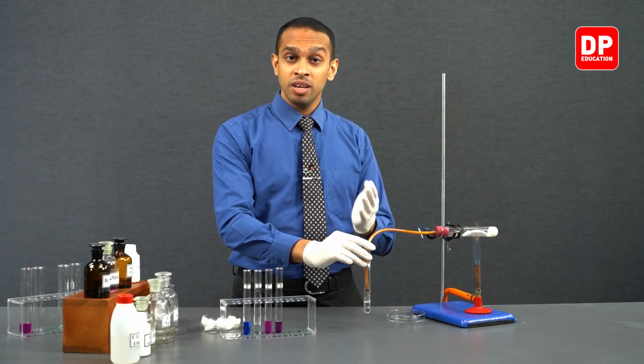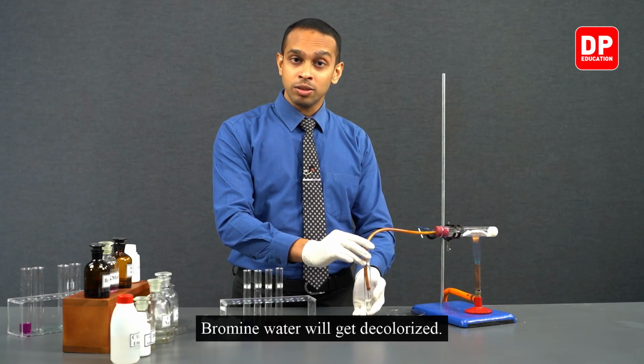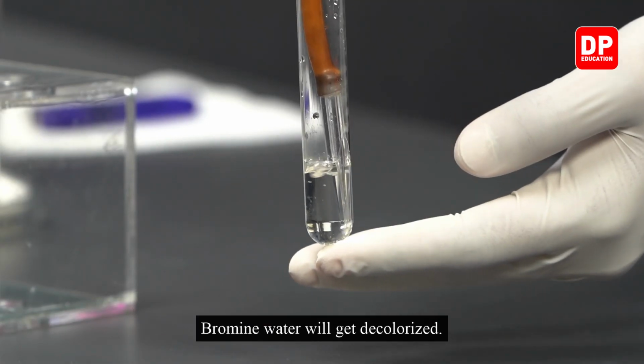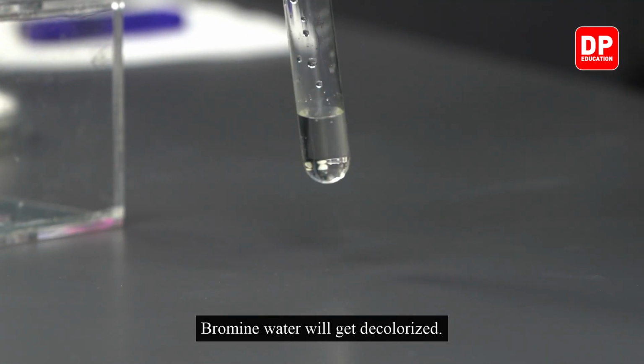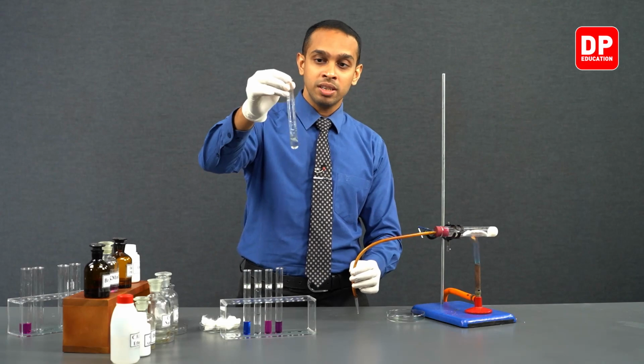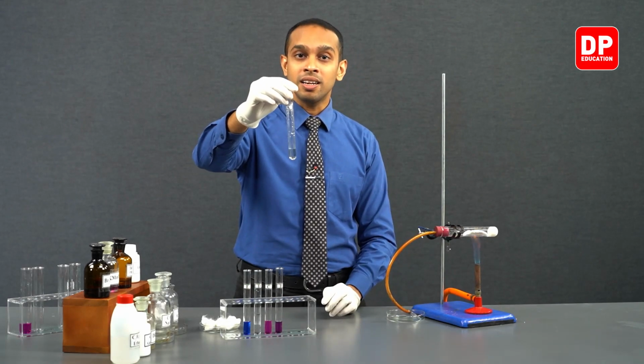This is because the ethene gas that is produced here is going to react with the bromine present in bromine water and will turn bromine water colorless.